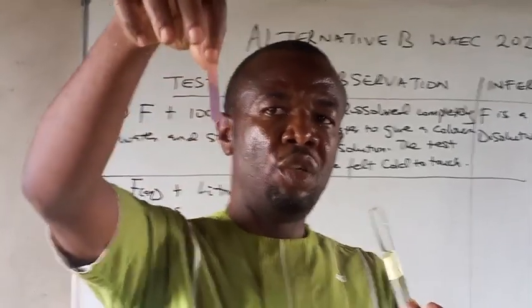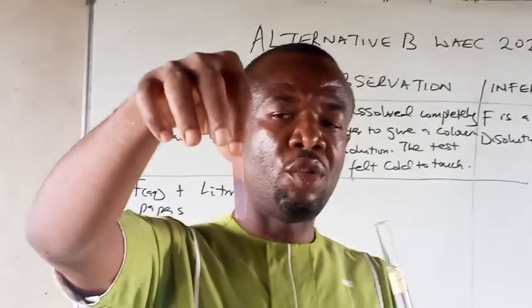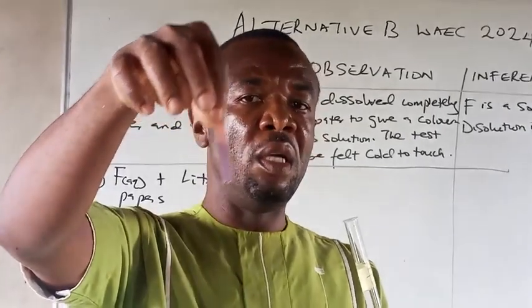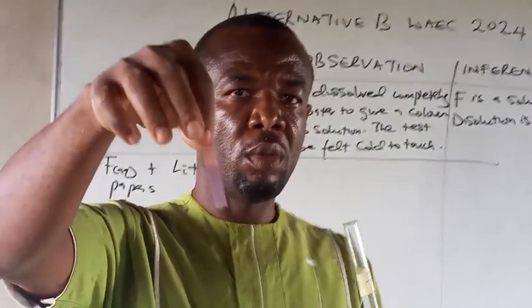So is there any change? Yes. The red one has been changed to what? Blue. So we can now see that this solution is alkaline, or it is basic. So we go to the board and report our work.